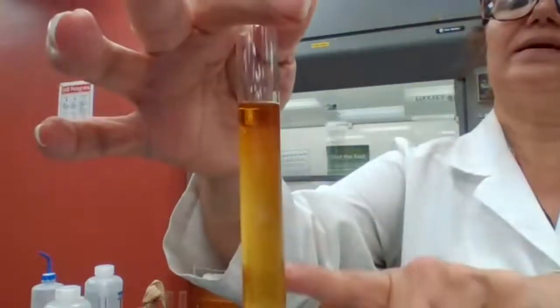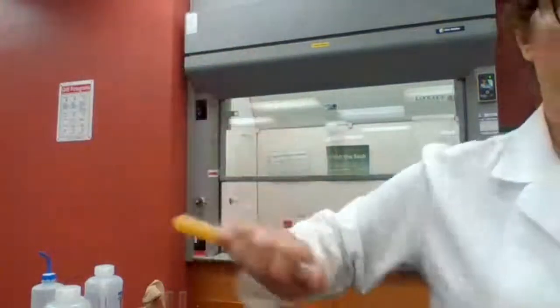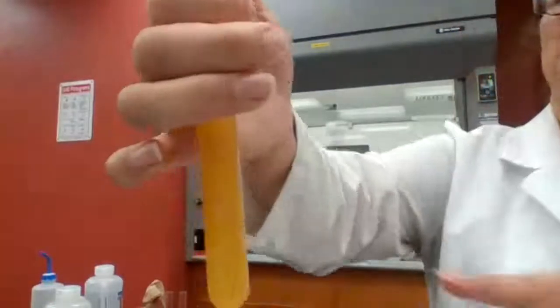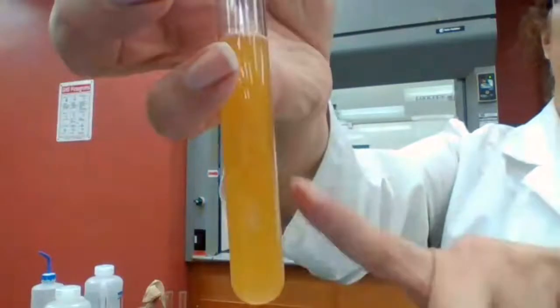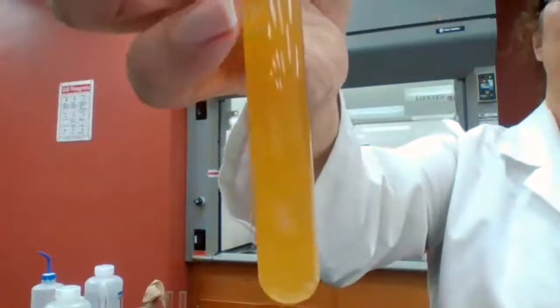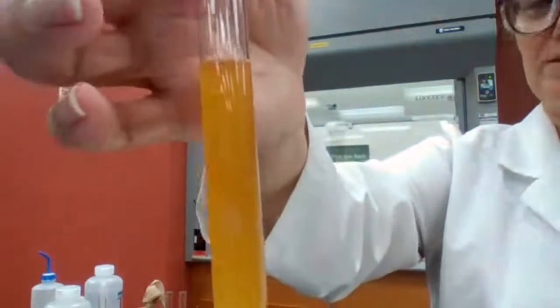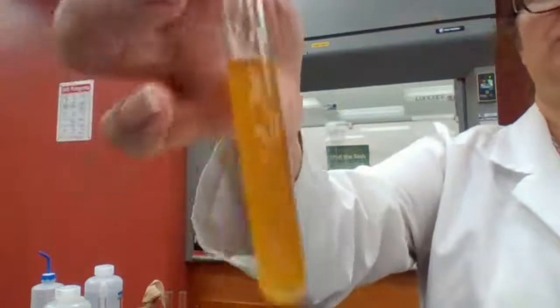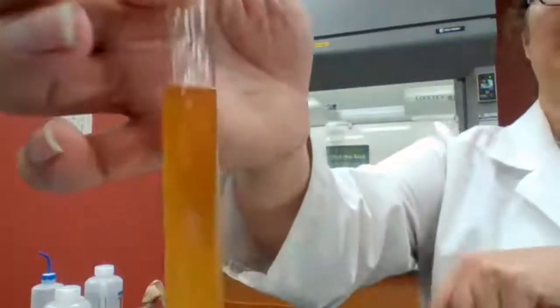And it's a little cloudy, and that cloudy part is the iodoform positive test that is forming. So we were looking for a precipitate or cloudy solution, and that's what we have. A cloudy solution. This is from yesterday. It's not today's experiment for acetophenone, and I wanted to keep it and show it to you today if it did turn cloudy. Okay?